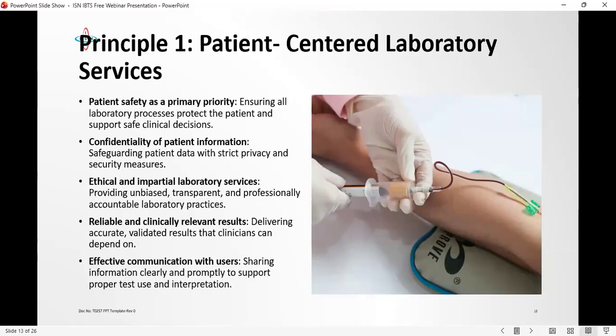It's a requirement that at every point in time, imagine if a troponin I result was delayed. You could not meet up with your turnaround time because all of a sudden, sometimes you cannot control these events when they happen, just like driving on Third Mainland and your car stops in the middle of the bridge. You have to have a documented protocol to, first of all, think of your clients. They need this result. They cannot just come to you because they like coming to you. You're not selling ice cream. You're not selling rice and beans. They need to eat. They can as well go somewhere else. They must not come to you.